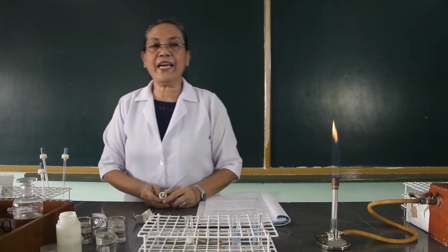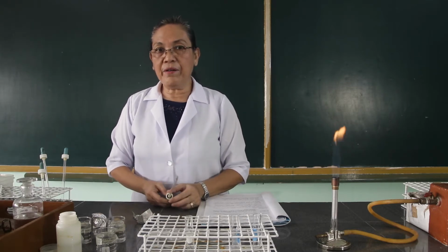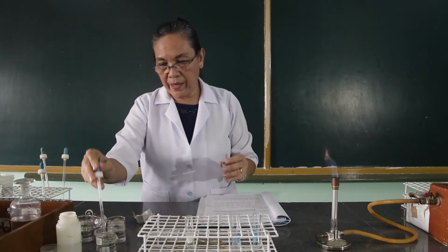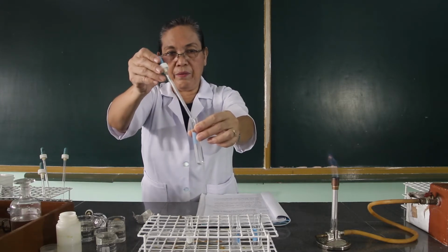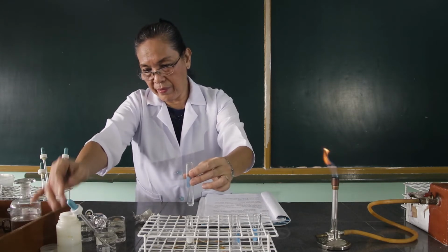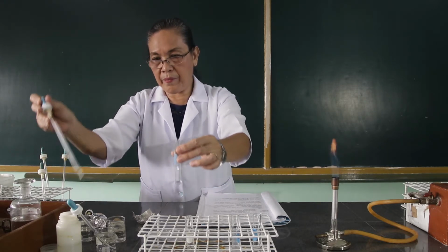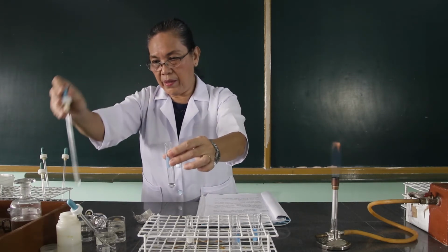So this time we will mix again the saturated ammonium chloride, the ammonium hydroxide, the barium chloride, and the ammonium carbonate. I want you to observe. Ammonium chloride, 1, 2, 4. Then another one, ammonium hydroxide, 1, 2.